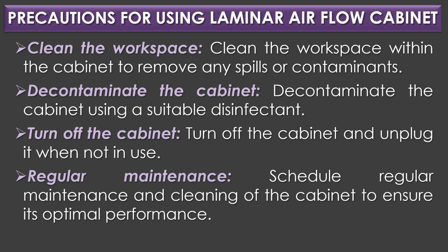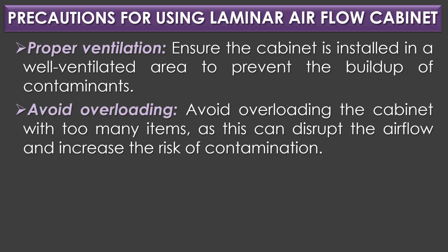Regular maintenance. Schedule regular maintenance and cleaning of the cabinet to ensure its optimal performance. Proper ventilation. Ensure the cabinet is installed in a well-ventilated area to prevent the buildup of contaminants.